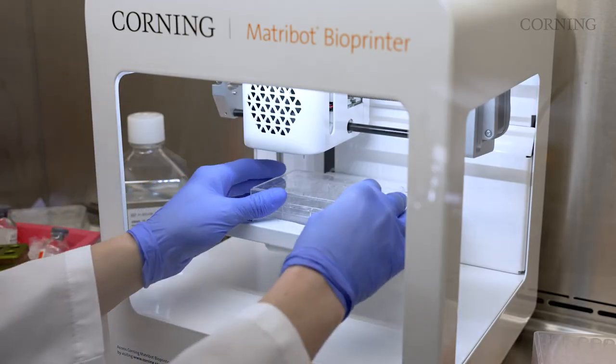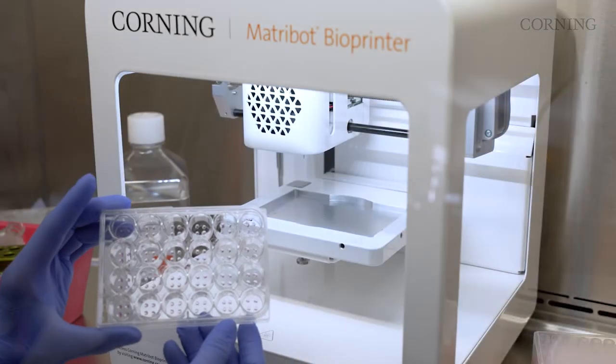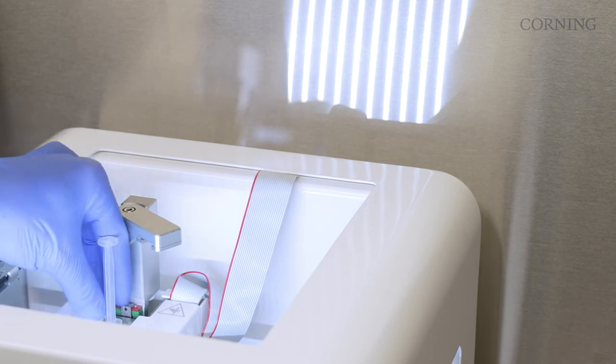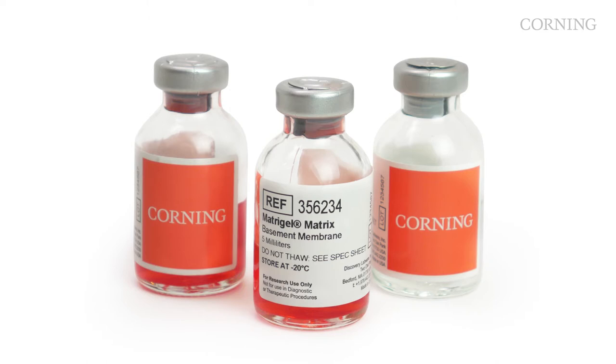The Corning Matribot bioprinter allows users to biodispense 3D droplets or droplet arrays for organoid applications. This advanced bioprinting technology is designed to handle temperature-sensitive hydrogels, such as Corning Matrigel matrix and collagen.